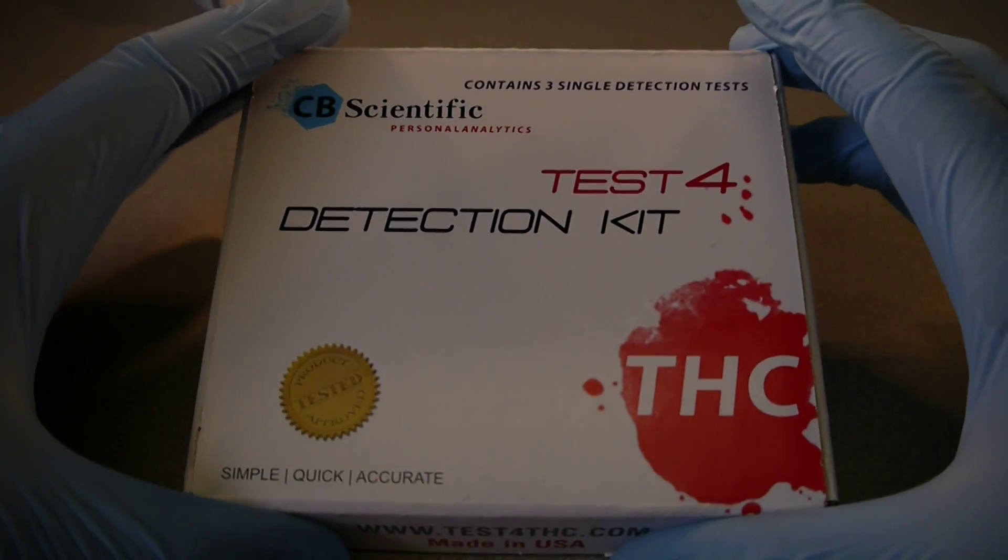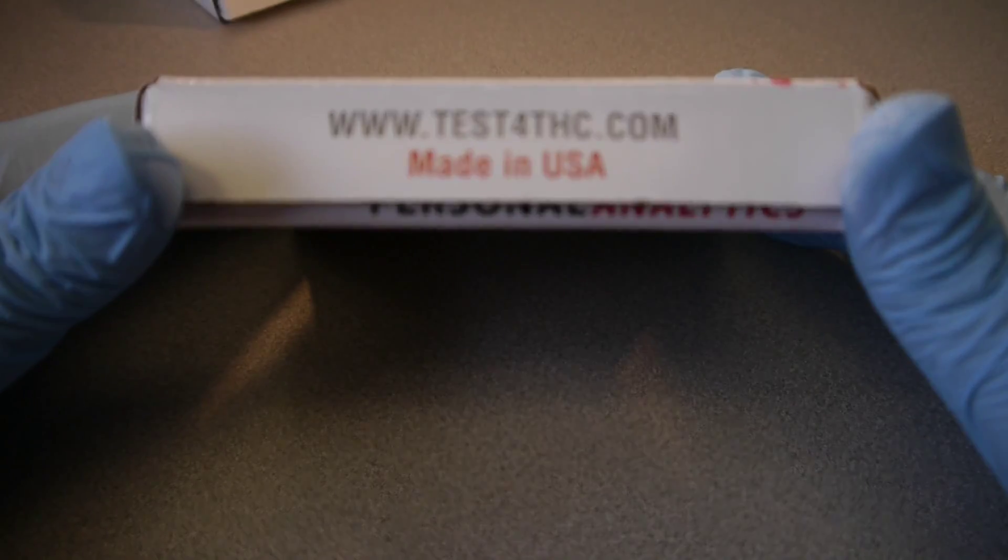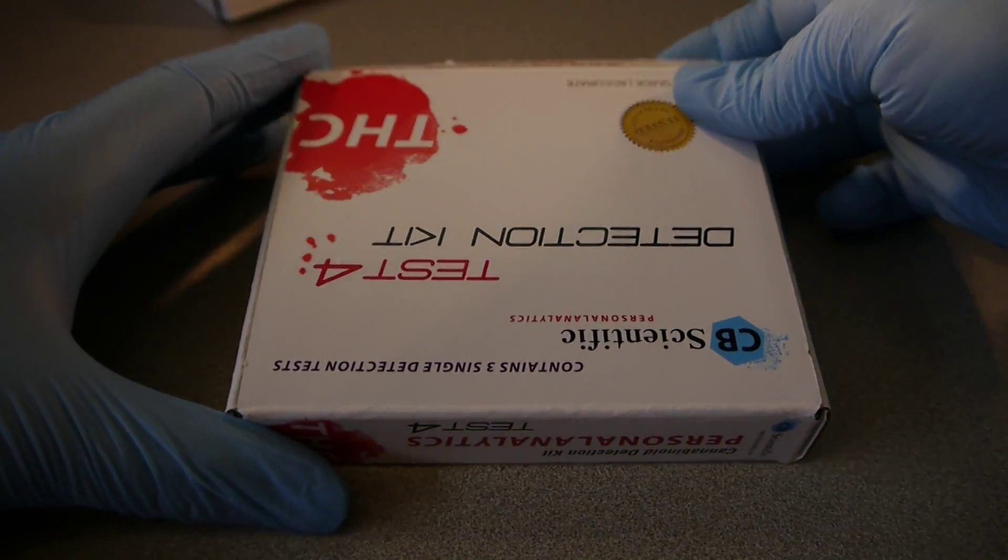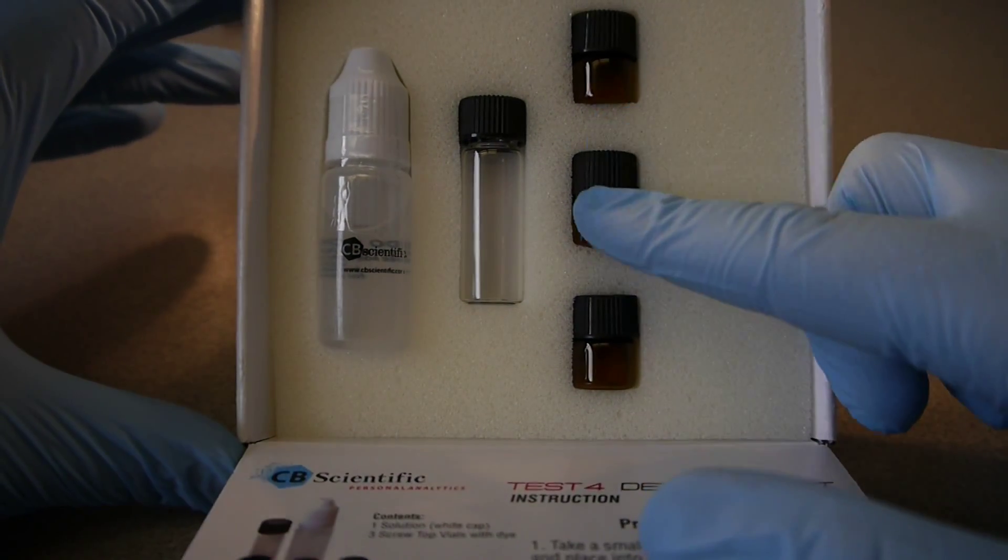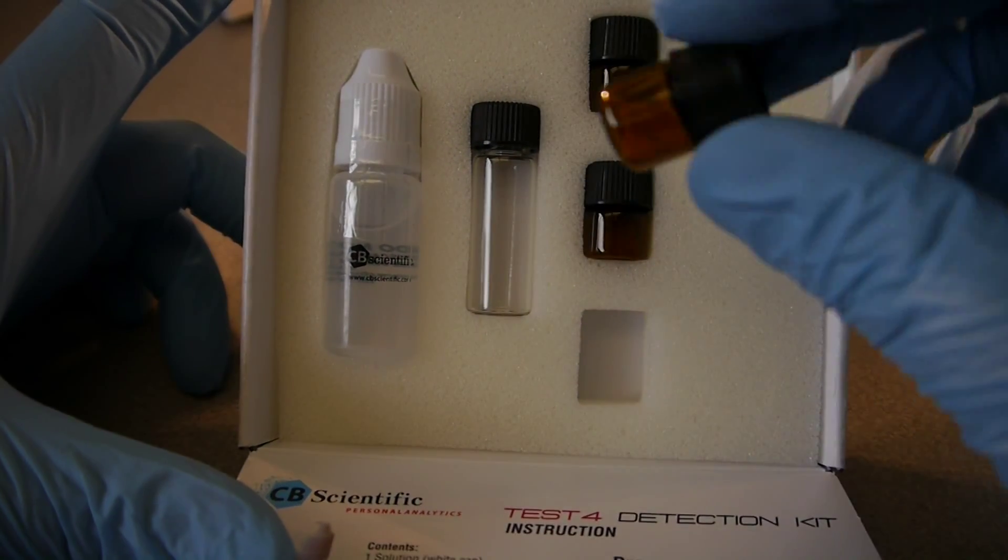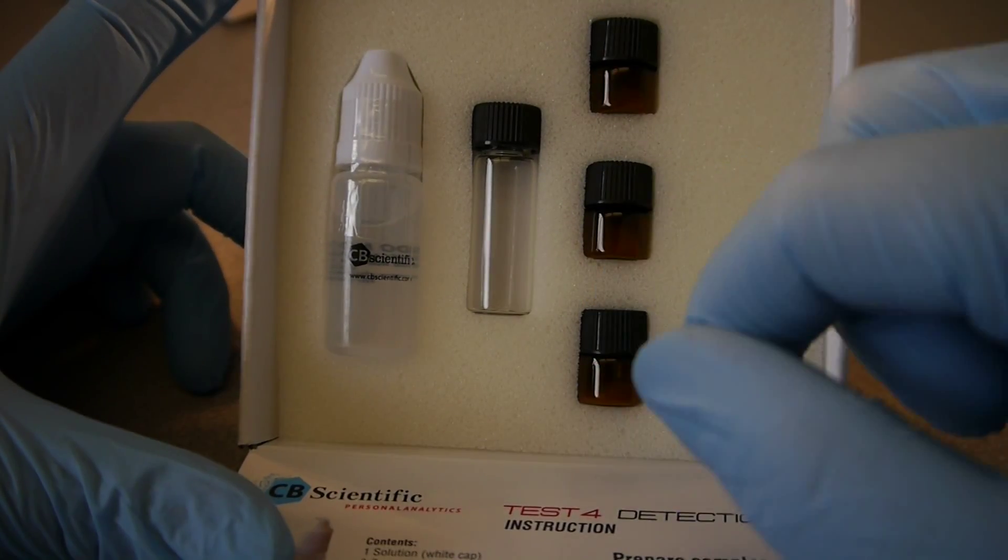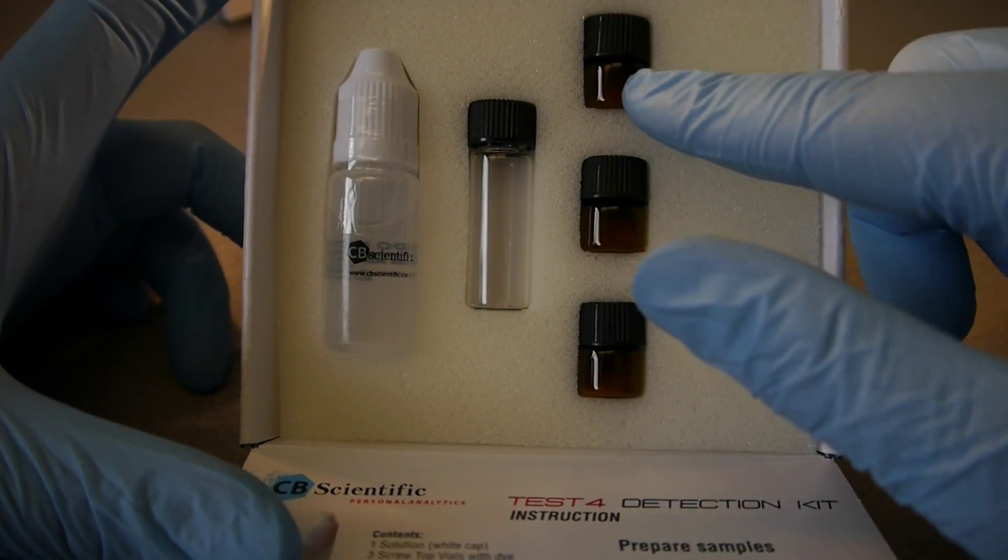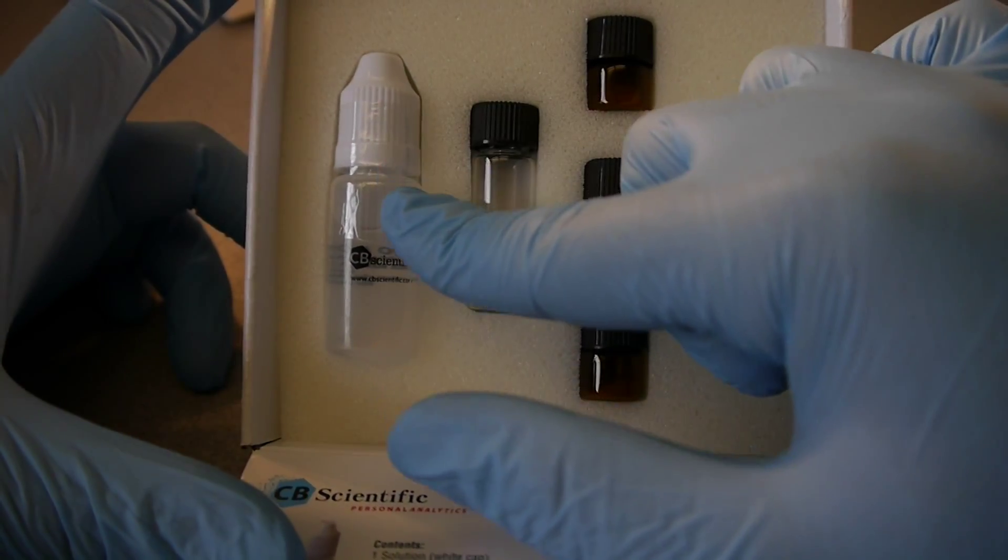First, we're going to start with the THC detection kit. And just like you've seen before, this is from test4kits.com. You can pick these guys up there. It's made by CB Scientific. Let's flip it around, and this is how we open her up. And on the interior, we have our three little vials. These are darker vials because they are UV resistant. So whenever you get these detection kits, you must leave the dye solution remaining inside these vials until you use it, which you would put it then in the reaction vial. So again, three vials, three separate detections. One reaction vial, you just wash it out, and you have your solvent bottle.